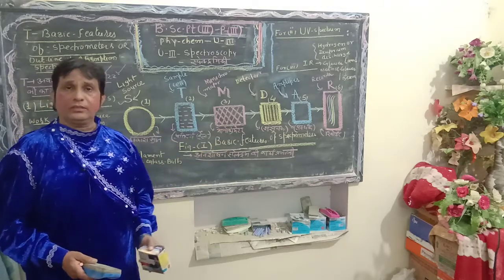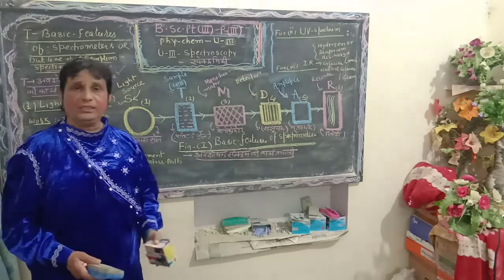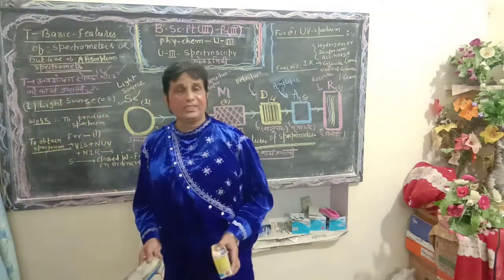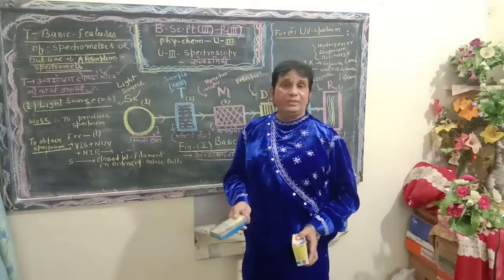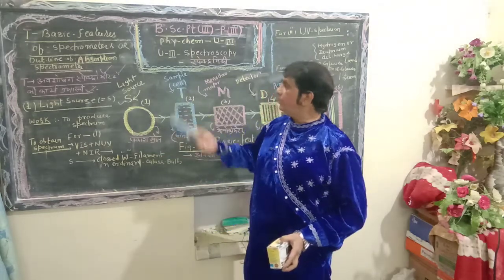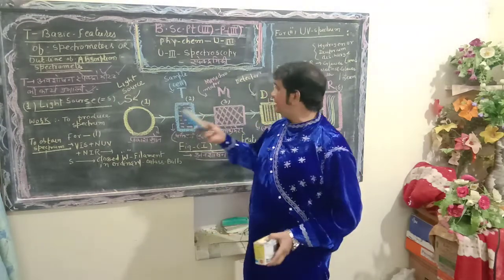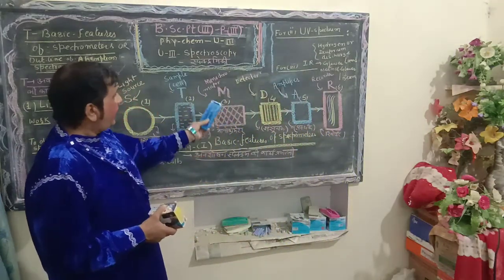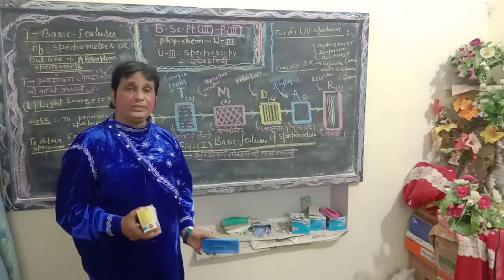This large spectrometer is formed by 6 minor instruments or devices, of which let us discuss the first one. First one, S1, denotes the light source, which is further connected to device 2. Device 2 is known as the sample cell and symbolized by T. Similarly, third one is the monochromator, symbolized by M, which is further connected to detector 4, and the 4 is known as the detector.